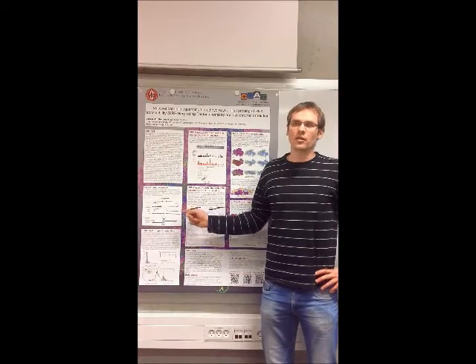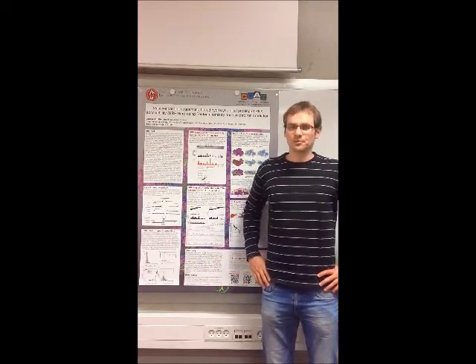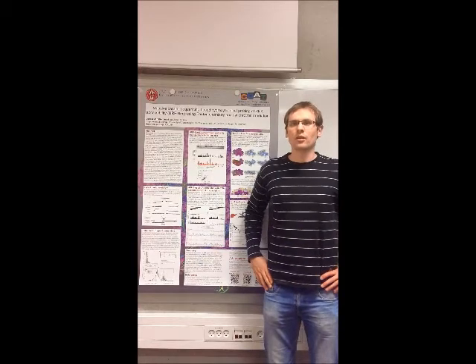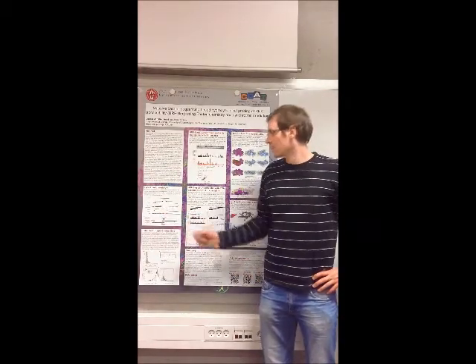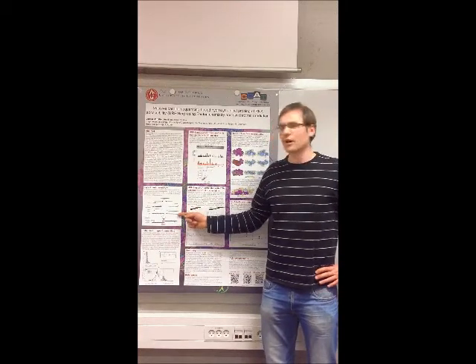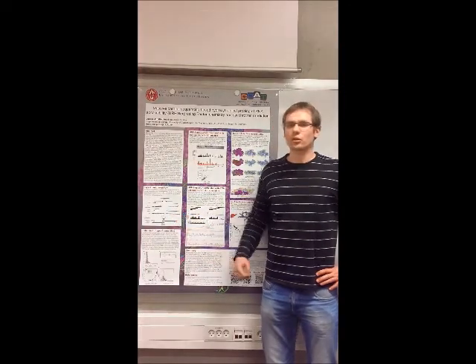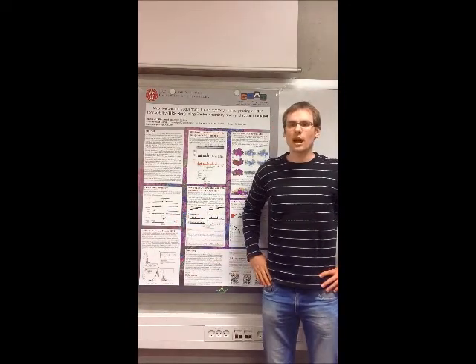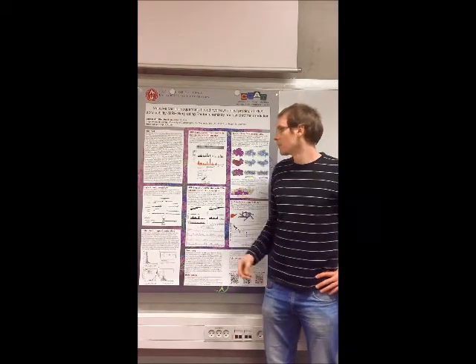The synthesized cDNA terminates on the probed site, and to those 3' termini, the adapter is ligated. The constructs are subsequently PCR amplified, pooled, and sequenced on an Illumina machine with the paired-end protocol.